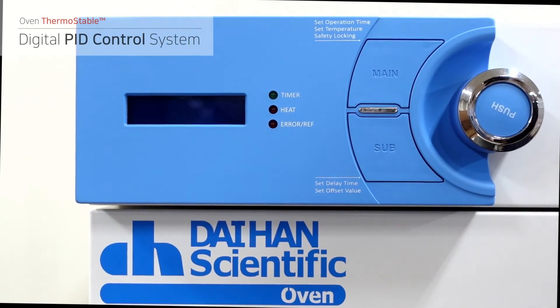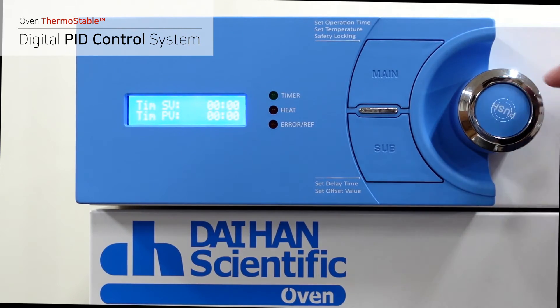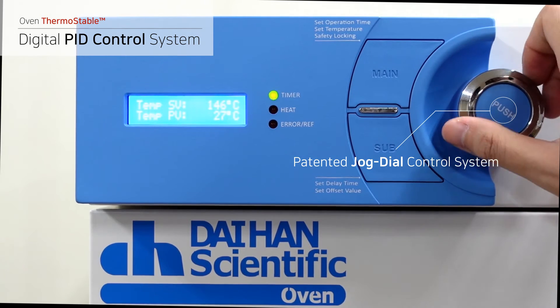The digital PID control realizes the best temperature accuracy and uniformity. Moreover, a patented jog dial is used to maximize ease of control.